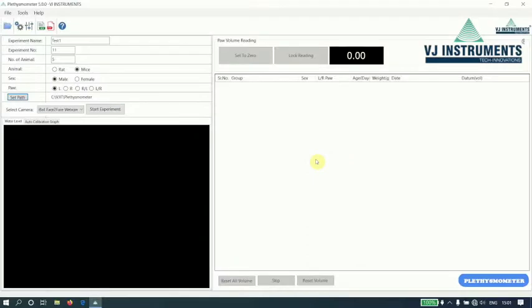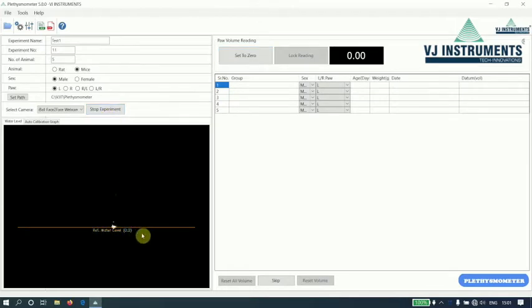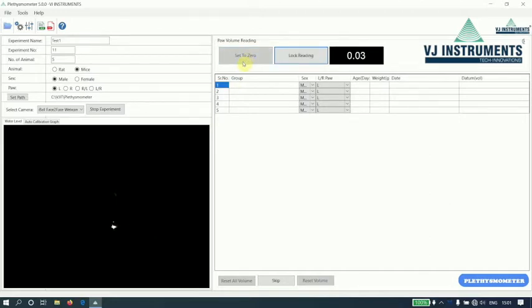Now, let us start the experiment by clicking Start button. Once we click on Start button, the reference water level is set. It should be within plus or minus 5. So, let us click on Set to 0. And insert a 2CC cube to check whether the calibration we have done is proper.